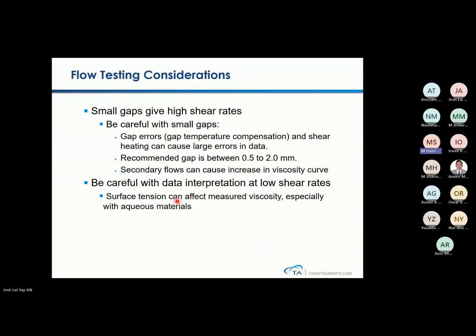We know that when the epoxy and hardener become hardened, it will stick to the geometry. So can we proceed with this kind of test, or is there a limitation, or do we have to keep monitoring it before it becomes solid?